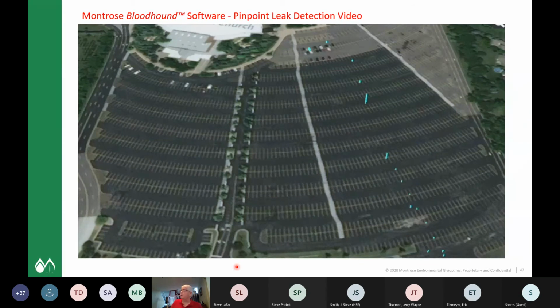So we created a source of emissions of acetone, and then we put it out, and we took the PTR, and we're going to find this. So any conventional search system, they call it mowing the grass or walking the grid, but basically that's what you do here. And you can see we started back here in the corner, and you walk up and down, and we got some hits here, which are bigger concentrations. Come back down, some more hits in this area, and so on and so forth.